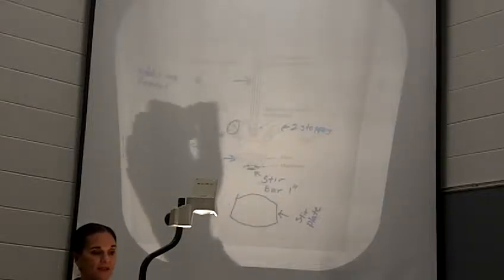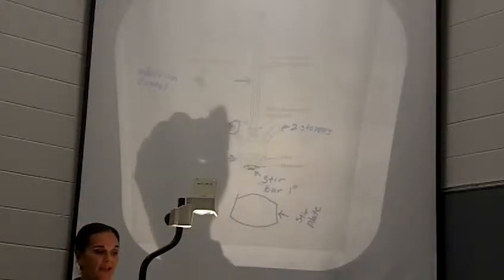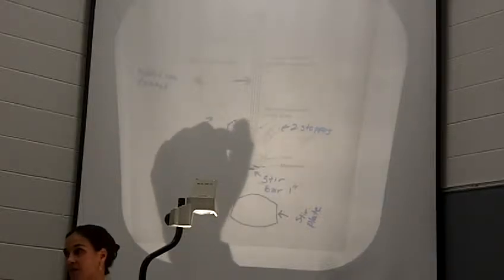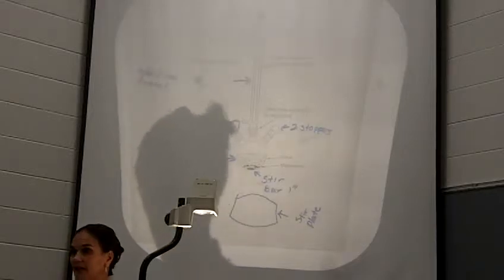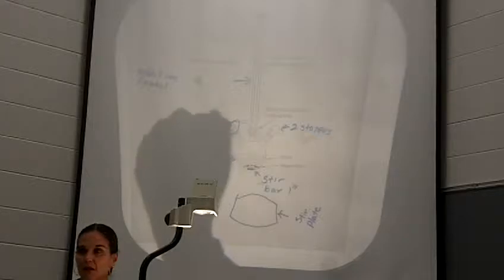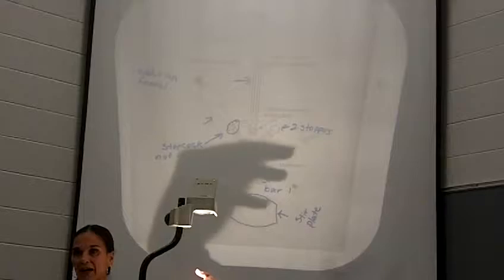Best thing to do is put the ether in the separatory funnel first. That checks to make sure your stopcock is not open, it's closed. So if you put a little extra ether in here, that's not the end of the world, okay? Then put your alkyl bromide in there. By putting the ether in first and then the alkyl bromide, the alkyl bromide is a halogen. It's more dense than the ether. It will fall to the bottom.